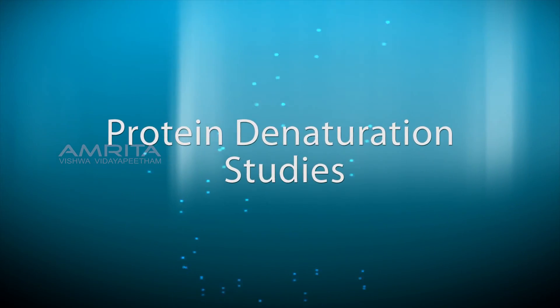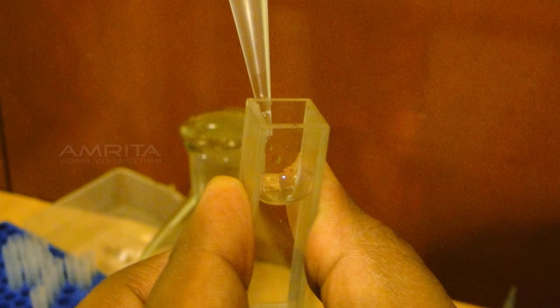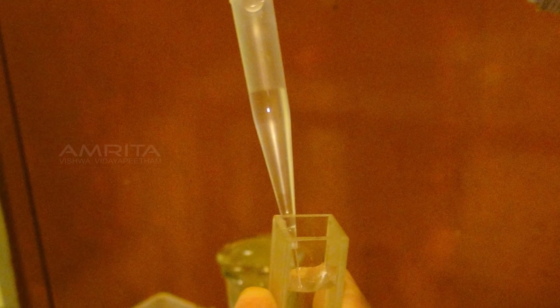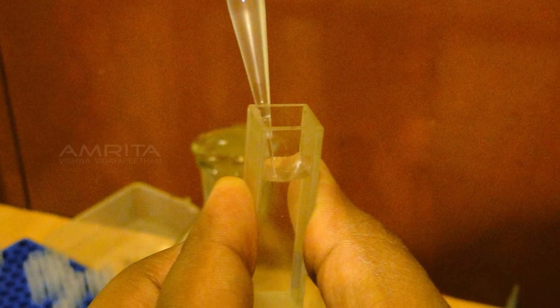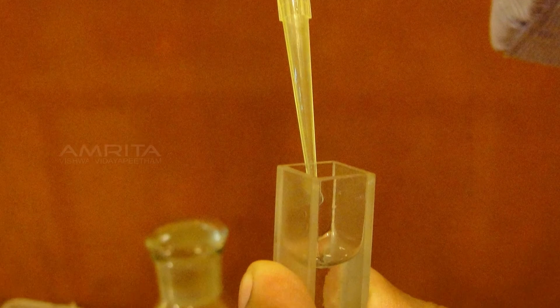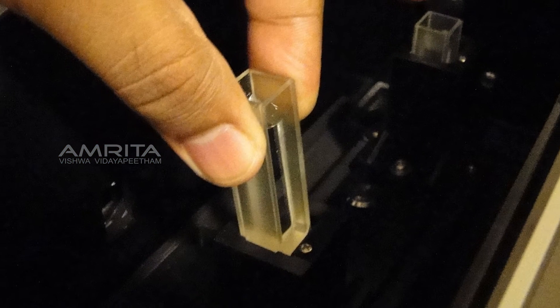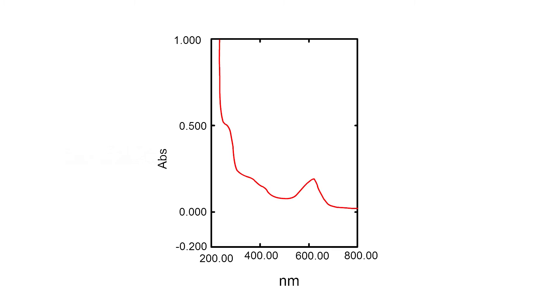Protein denaturation studies: Transfer 3ml of potassium phosphate buffer into a cuvette using a pipette to be used as a blank. To a second cuvette, add 3ml of potassium phosphate buffer using a pipette, then add 100µL protein solution and mix well using the pipette. Place the cuvettes in the UV spectrometer slots and record the spectrum at 625 nm.